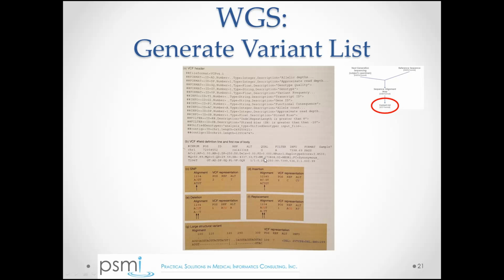Here for instance, I'm looking at this chromosome and here's the reference sequence that I'm using right here, NM173808, and you can go to the NCBI site, plug in that identifier, and it'll show you the FASTA file for that particular reference. So for the most part, what these reference sequences represent are the most common base at every position along the way. I think every 3 to 5 years or so, NCBI plans on updating their reference sequence to be the most accurate that it can.